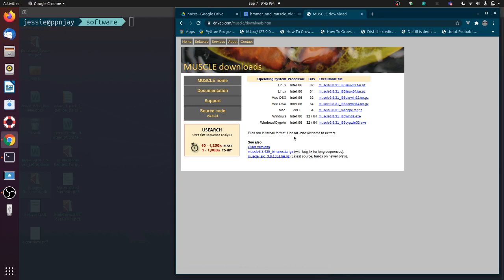For Windows users who are using Bash, I did download this before on my past Windows computer, and I did the source code. So, which is why I'm also going to show you how we're going to do it from the source code. But first, I'm going to show you downloading the binaries, which is particularly helpful for the Mac users.